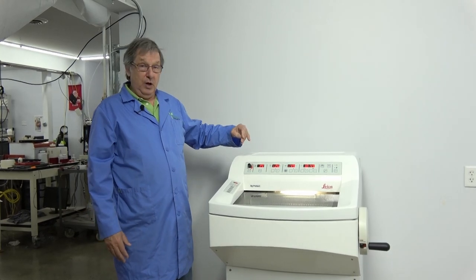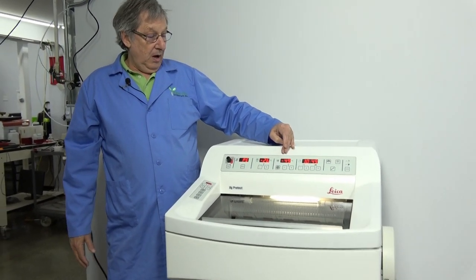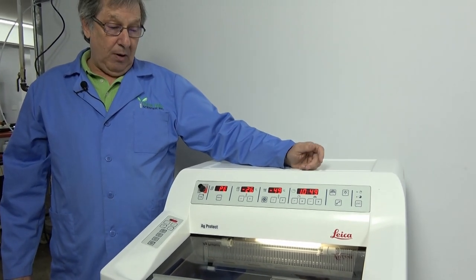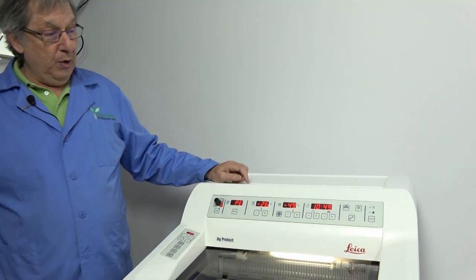Some of those options would include the vacutome, optional cold head, UV disinfection, and power cutting. This unit comes with all those options other than the power cutting.